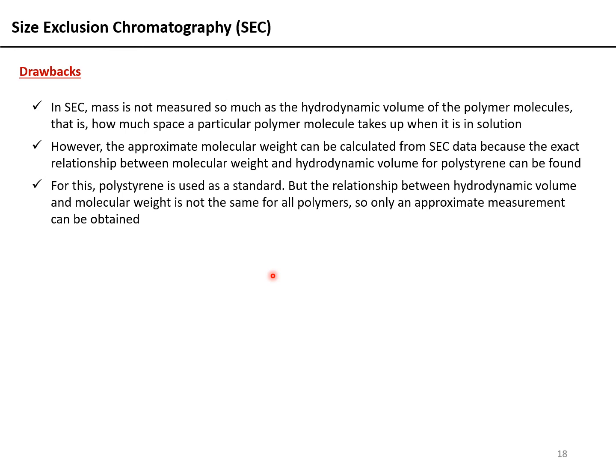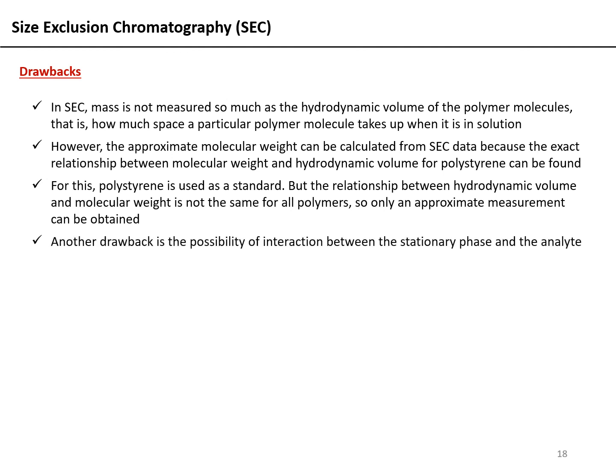So you can have a sort of correlation based idea of what can be the size of your protein based on the retention volume. But the relationship between the hydrodynamic volume and molecular weight is not the same for all polymers, or for all proteins in our case. So you can only get an approximate measurement. You can never be 100% sure.